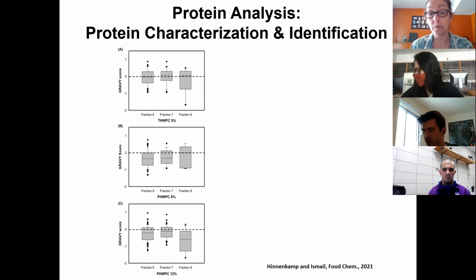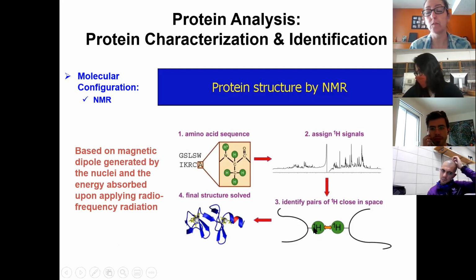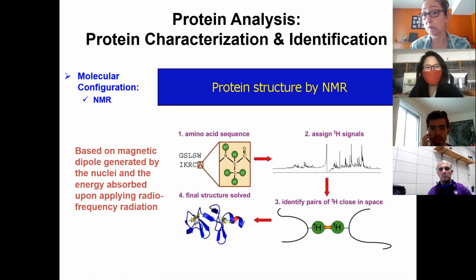So you can do a lot of different things with LC-MS as well as bioinformatics that comes as a tool to analyze your peptides. Last thing here is NMR. NMR is also used to determine the tertiary structure of the protein based on the signaling and spacing of protons in the sequence of amino acids. So that is another technique. We don't use it often. We don't use it in our lab, but it is a technique used for elucidation of a protein's tertiary structure.